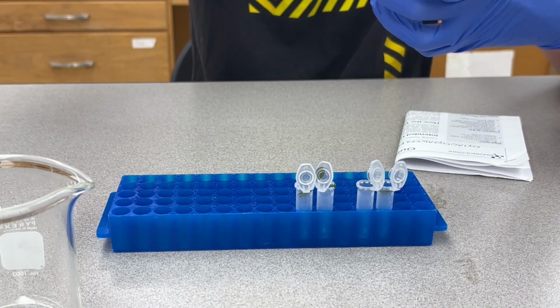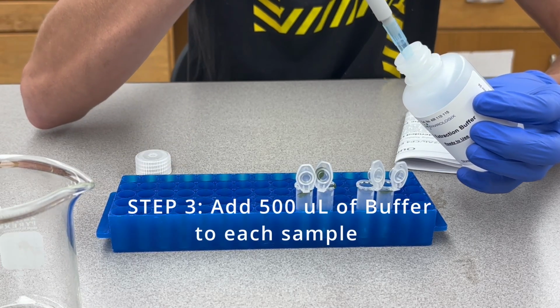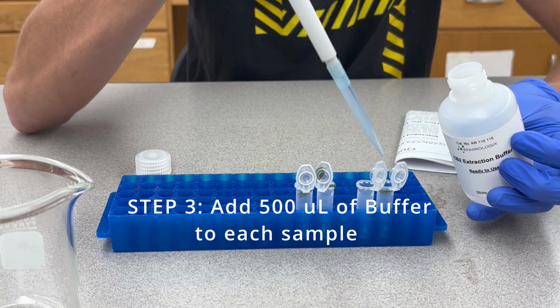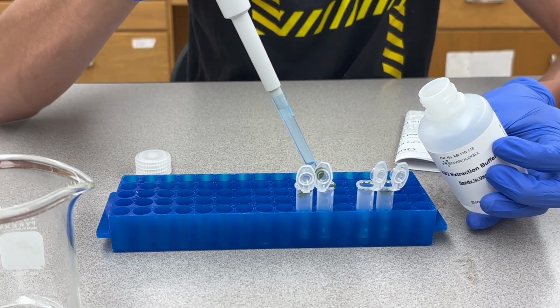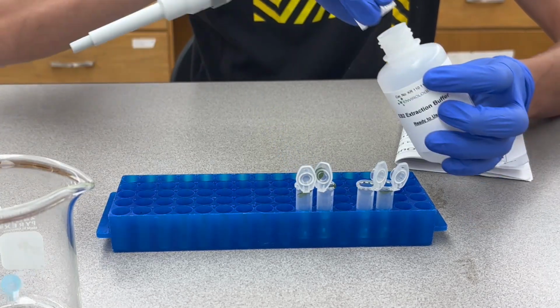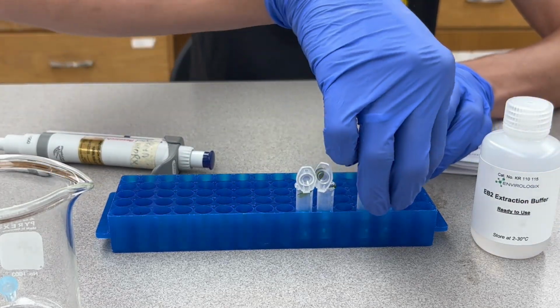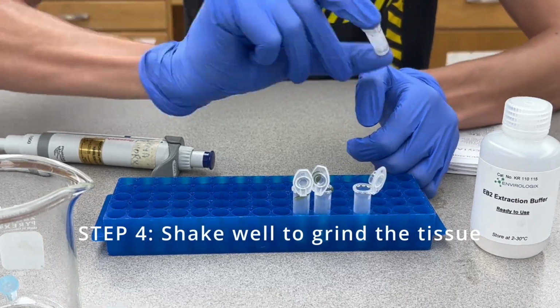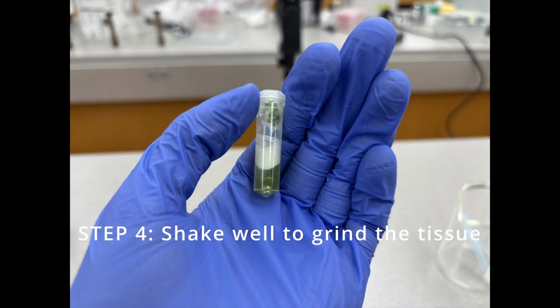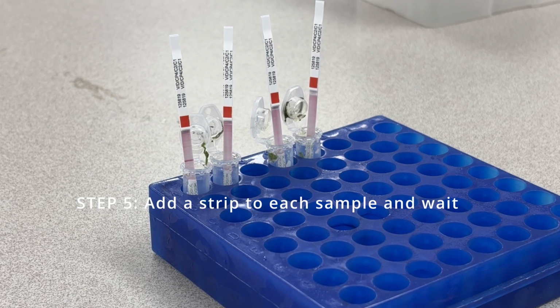With our samples collected, we'll follow the protocol provided with the kit. In this case, we'll add 500 microliters of buffer to each sample. After adding the buffer, we'll shake the tube to grind the leaf sample until it's fully homogeneous. Then, we'll add our strips and wait 10 minutes for the test results.